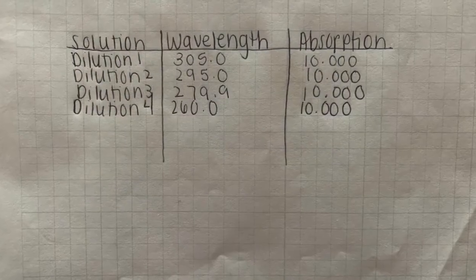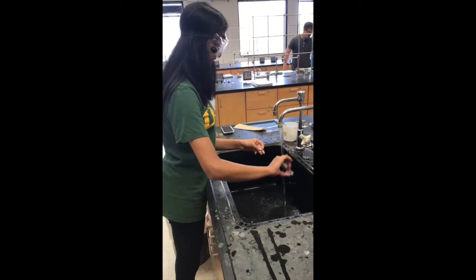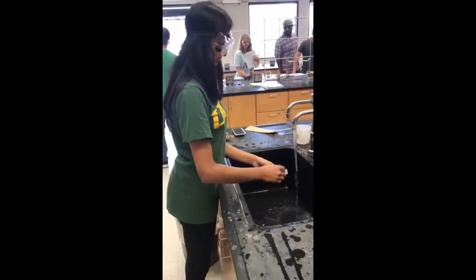It is essential to record the absorbance of each sample in our notebook. After we have finished the experiment and obtained the proper readings, we dispose of our solutions properly and clean our glassware.